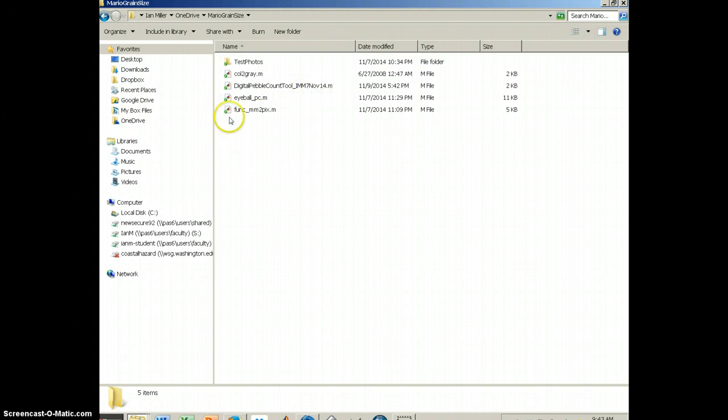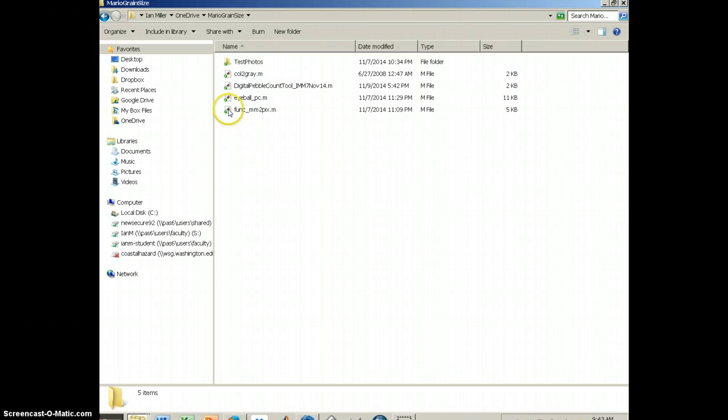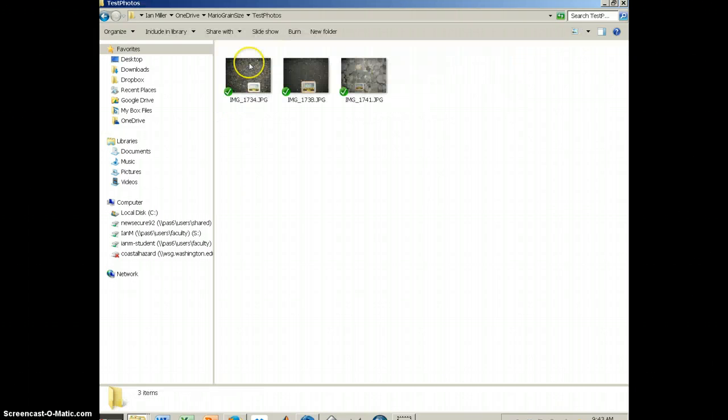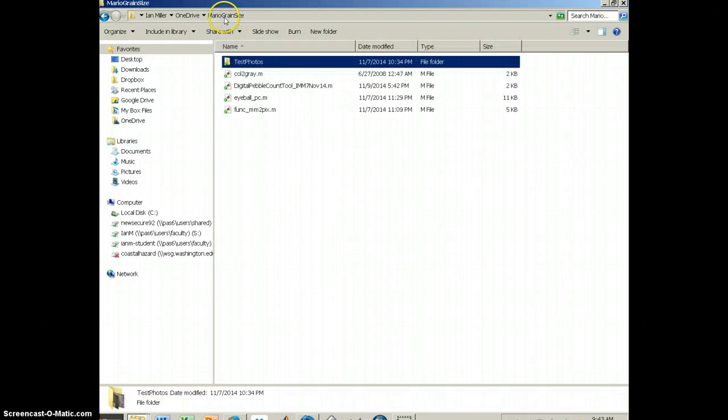If you have MATLAB installed on your computer, you will see this icon next to them with that little symbol. And then you should also have a folder in there with your photos, and in this case I have three test photos in there.